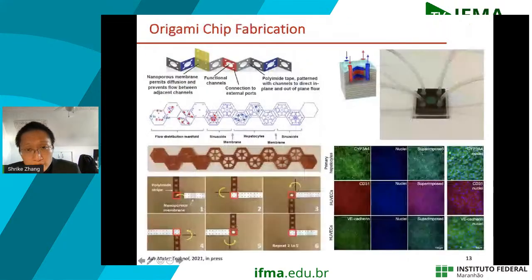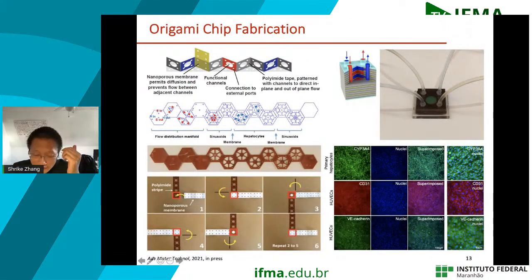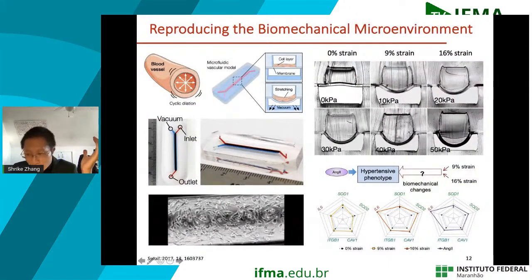All right, so another, more recent example is that conventionally, these devices have to be made in the clean room and assembled together. So the process is labor intensive and potentially time consuming, right? Making a single device might be okay, but if you want to make many copies of them, it might be problematic if you want to achieve a certain complexity.